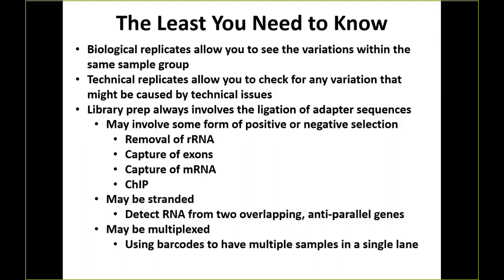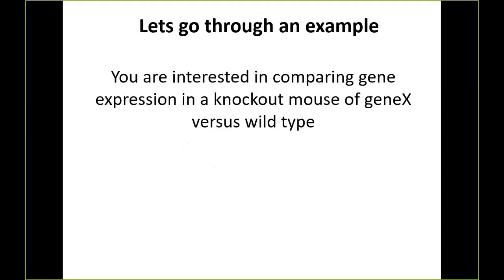Frequently will be, yes? Not really from what I've seen. Usually the barcodes are put in by the people making library prep, and a lot of times they'll do extensive testing to make sure the barcodes aren't going to cause bizarre errors. That said, if your lab is home brewing your adapters and you're home brewing your barcodes, it might be worth worrying about at that point. But from the commercial kits, I wouldn't worry about it too much.